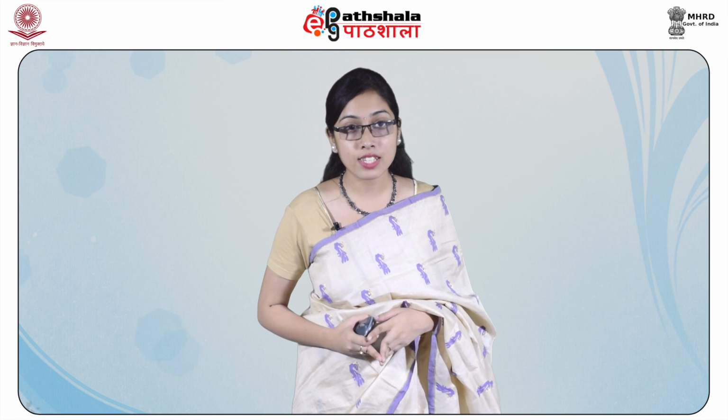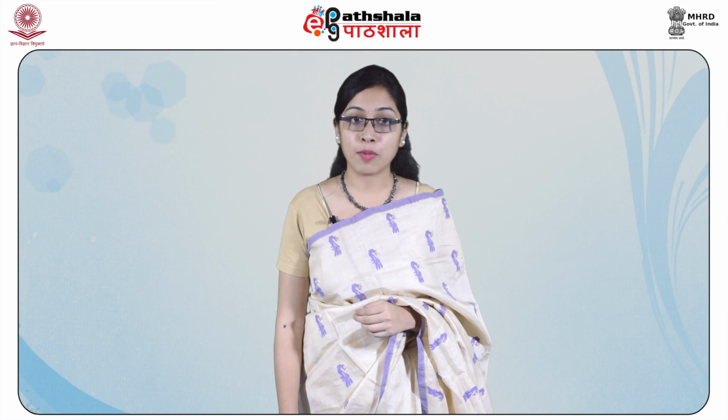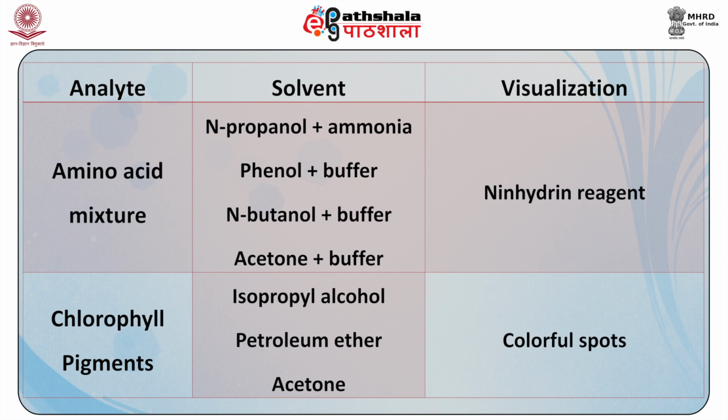A few examples of paper chromatography application and their analysis have been shown in this table, where in one column we have the analyte component, the next column shows the solvent and the third column is for visualization reagent. First, starting with amino acid mixture, the different solvents which can be used are n-propanol with ammonia, phenol with a buffer, n-butanol with a buffer and acetone with a buffer. The visualization reagent that can be used for this purpose is ninhydrin.